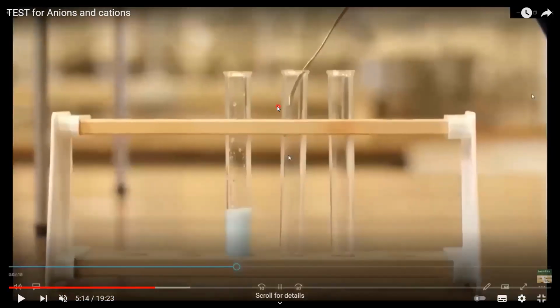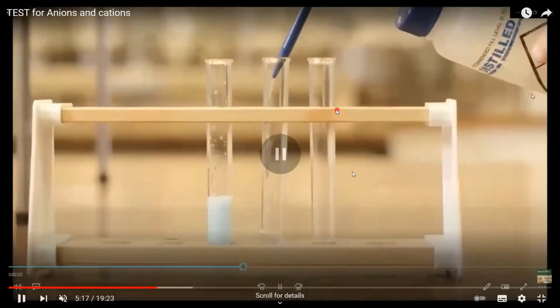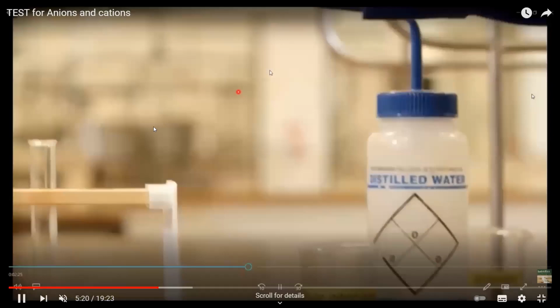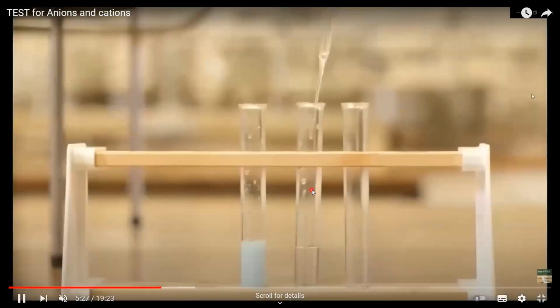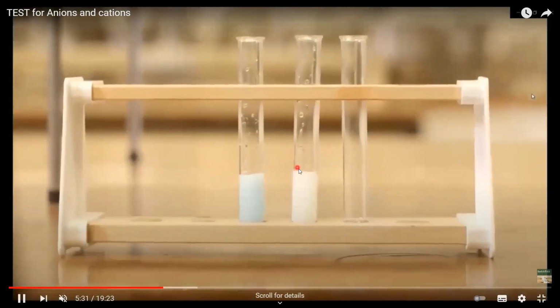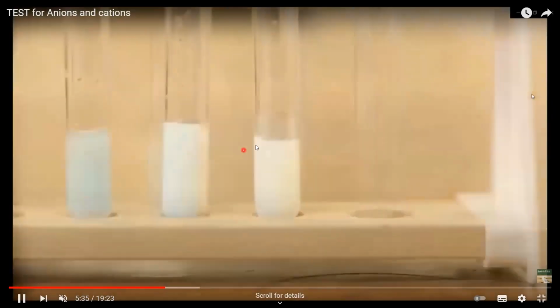Then we are again making a salt solution. We don't know which halide is there, maybe chloride, bromide or iodide. So first, using distilled water, we make a salt solution, then add nitric acid, followed by silver nitrate. When we add silver nitrate, what you observe? You'll observe a cream color precipitate. So a cream color precipitate means that bromide is there. This was the white precipitate.